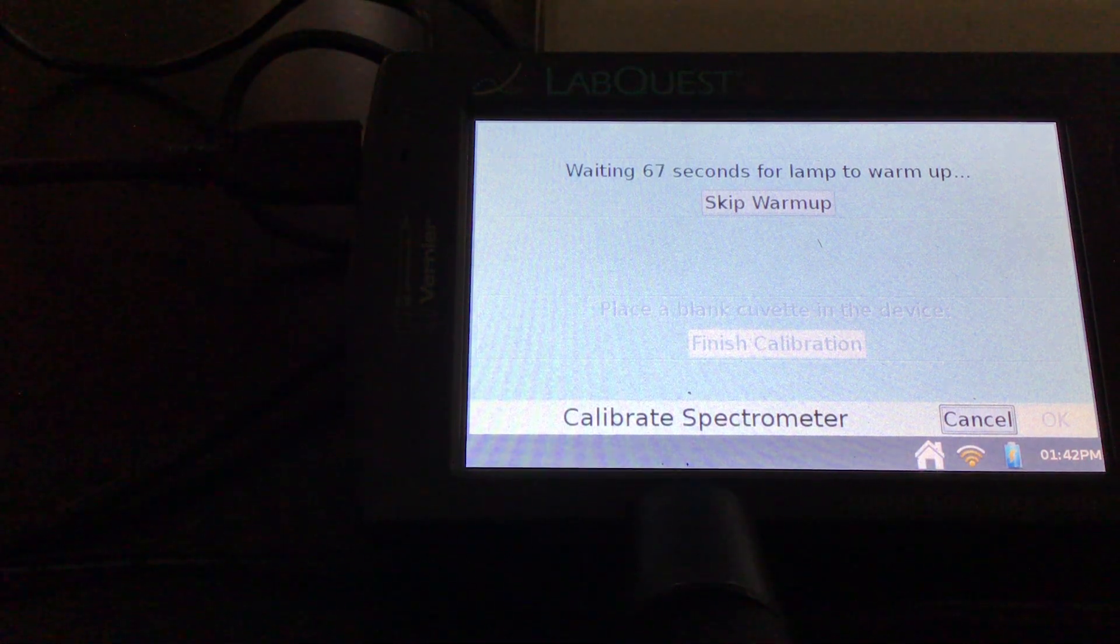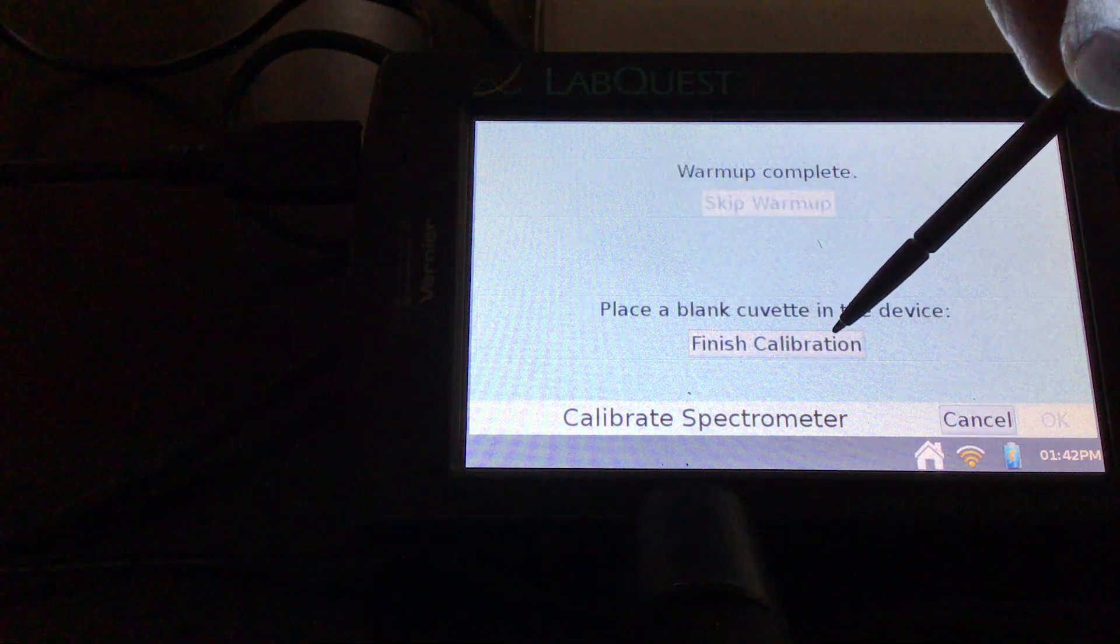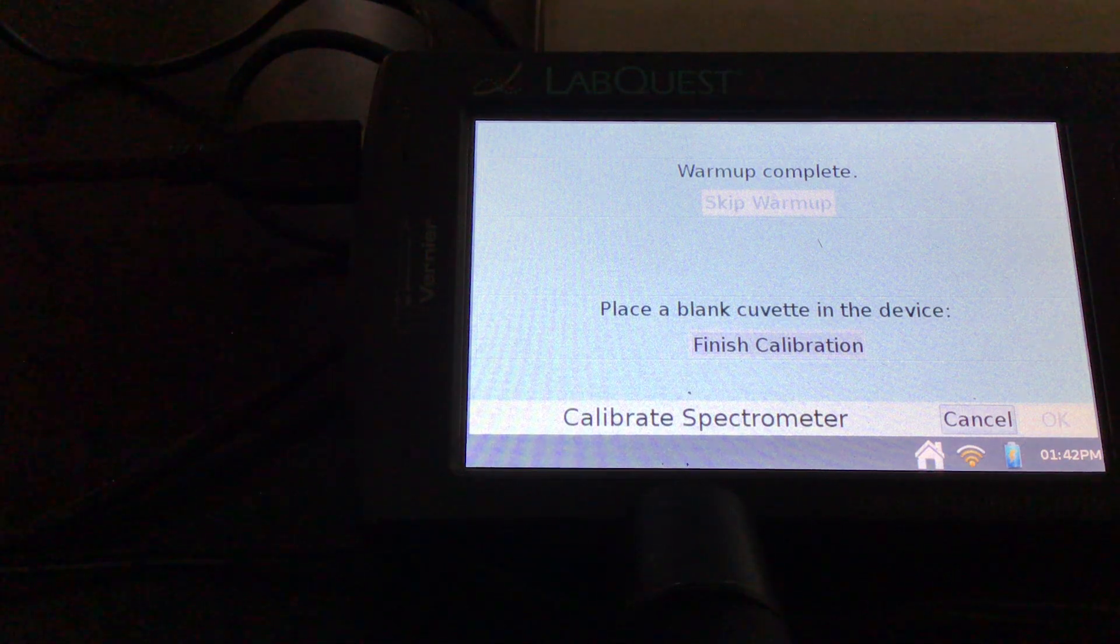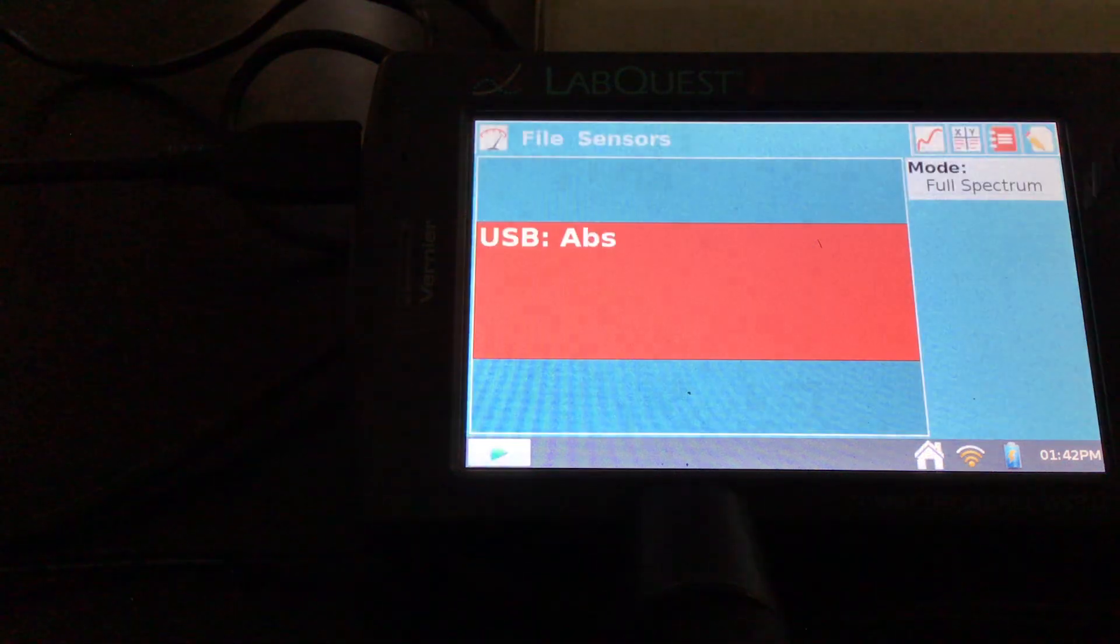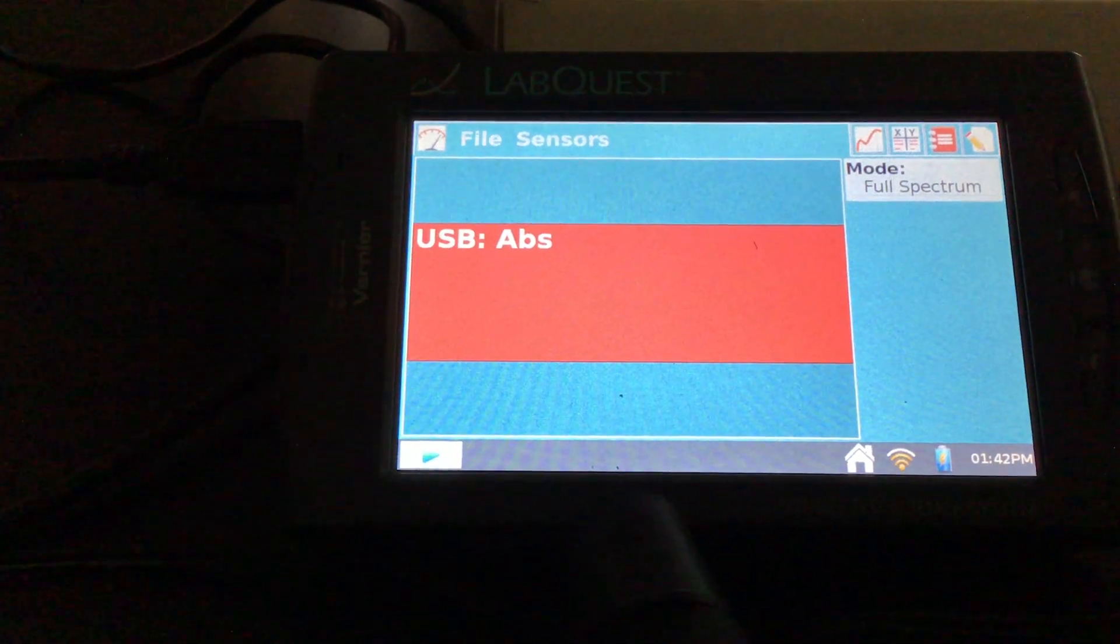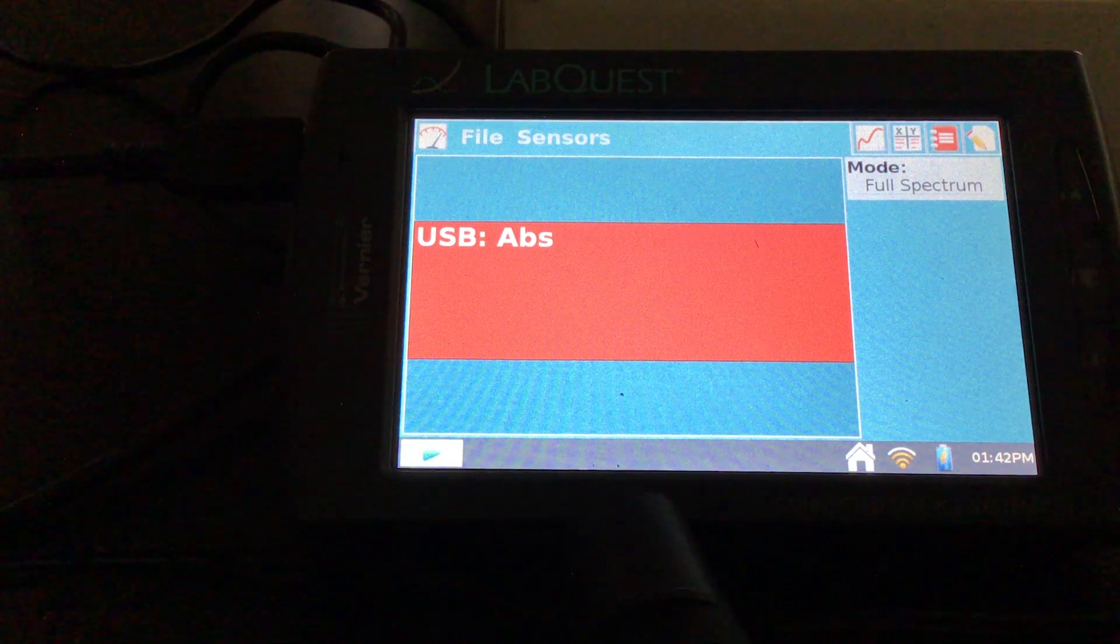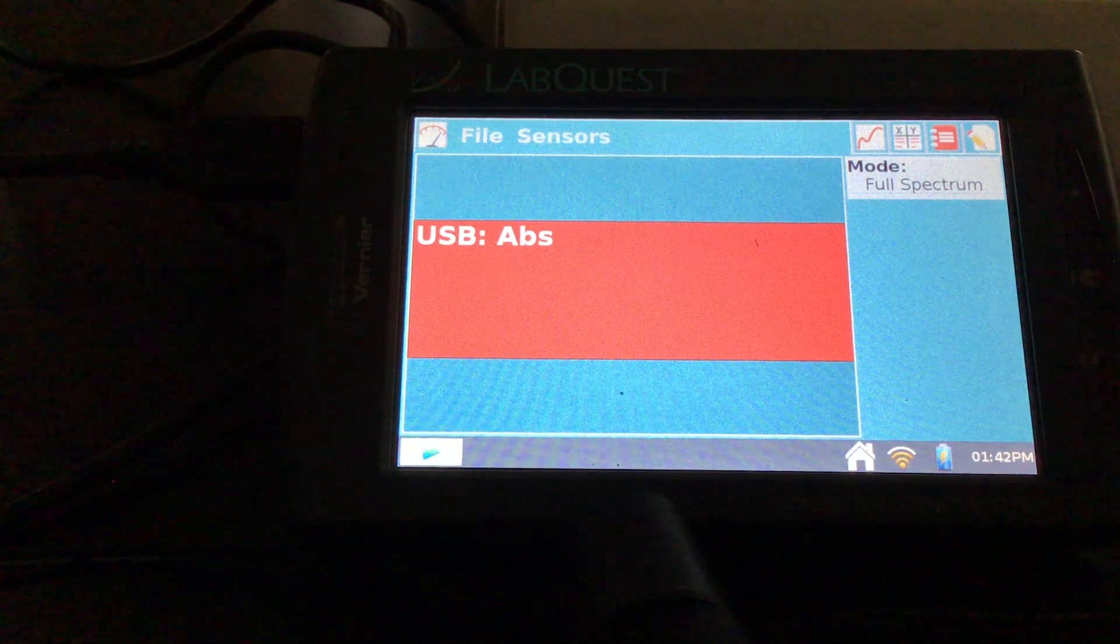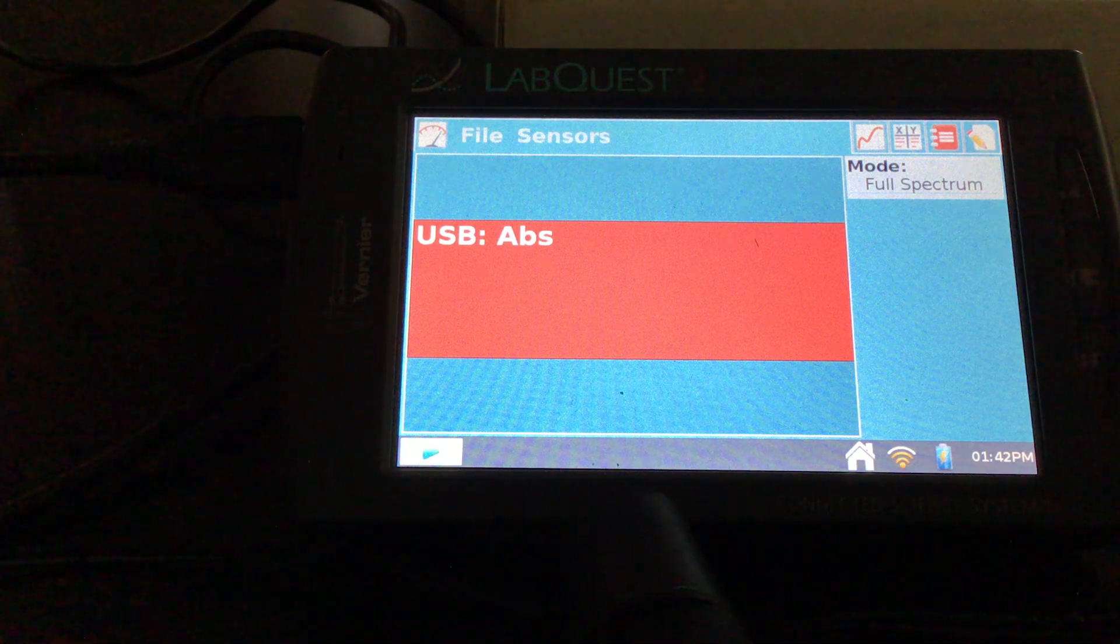So my SpectraViz has already been up for a while so I'm going to go ahead and skip the warm-up and then I'm going to finish calibration. Everything looks good there. And so what I'm going to do here is now we're going to figure out what our peak wavelength is going to be. So I'm going to use my most concentrated sample. I'm going to give that a little bit of a clean off before I put it into the SpectraViz.